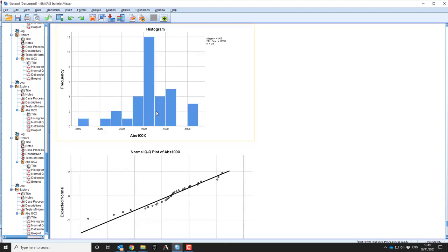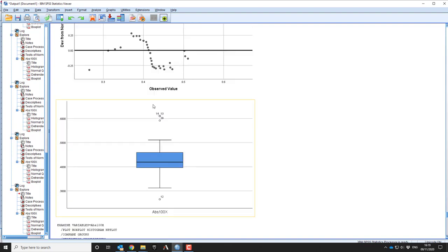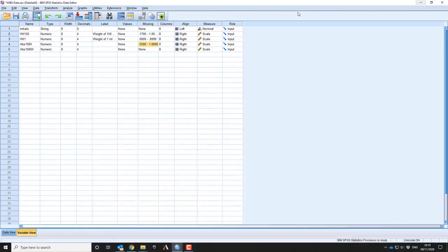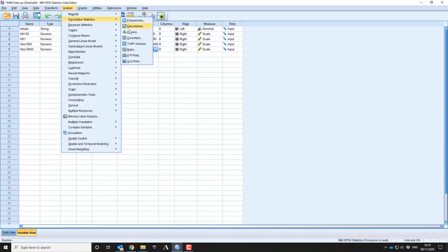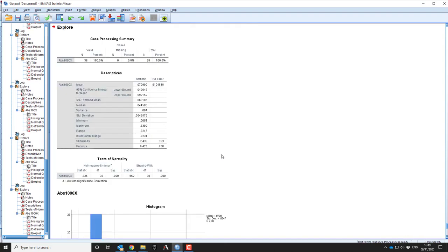Now the key thing for this absorbance experiment is it should be 10 times the value of the other absorbance experiment. So we need really to look at the other one to know what the two values should be, and to look at their variation, how precise they are. So if this is going to be, need to first look at the 1000, see what happens.